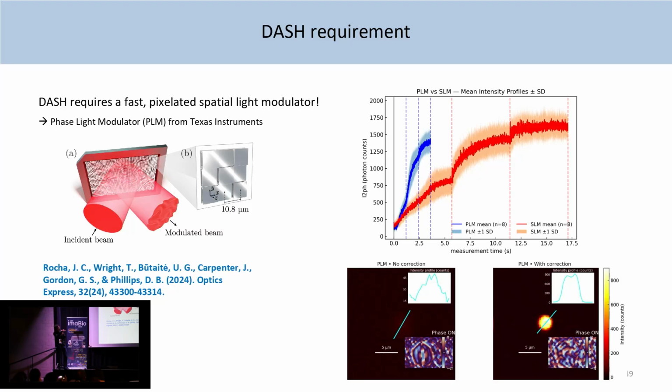So that is the blue curve. You see here the signal enhancement versus time. The blue one is correcting 400 modes with this MEMS mirror. That was done in maybe 2 or 3 seconds. And the red curve was done with a fast liquid crystal light modulator that was running at 300 hertz, which is already pretty fast for a liquid crystal device.